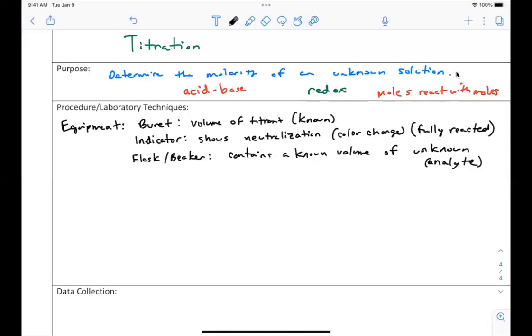For example, if you're doing a strong acid and strong base, and you start with a strong base in the flask, then if you put phenolphthalein in, it's going to start pink and you're going to go colorless. I think that's a lot harder to tell than flipping it. So it just changes the order, but technically it could be the same. But if you're talking about general proper technique, you would put the unknown in the flask.